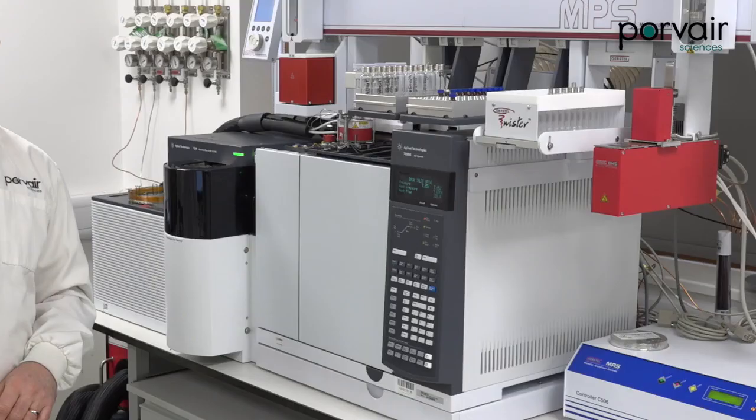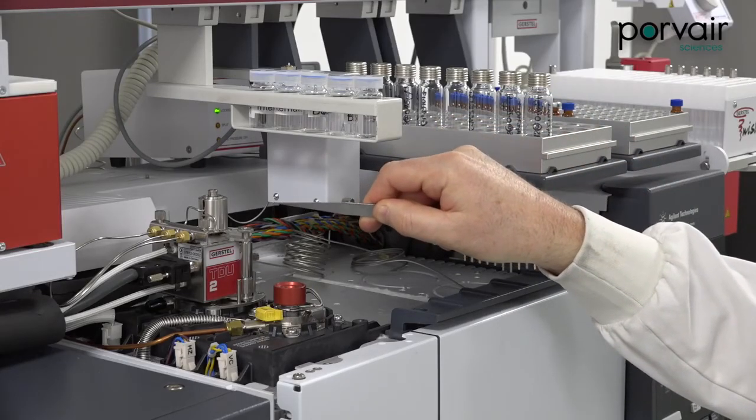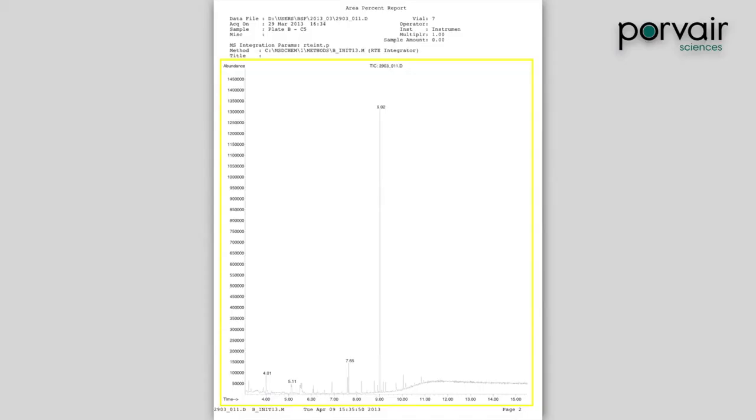Having combined the samples, they're analysed by GCMS using a splitless injection and a 250°C gradient. This has been shown to be sufficient to pick up most of the common contaminants that are likely to leach from polymers such as polypropylene.